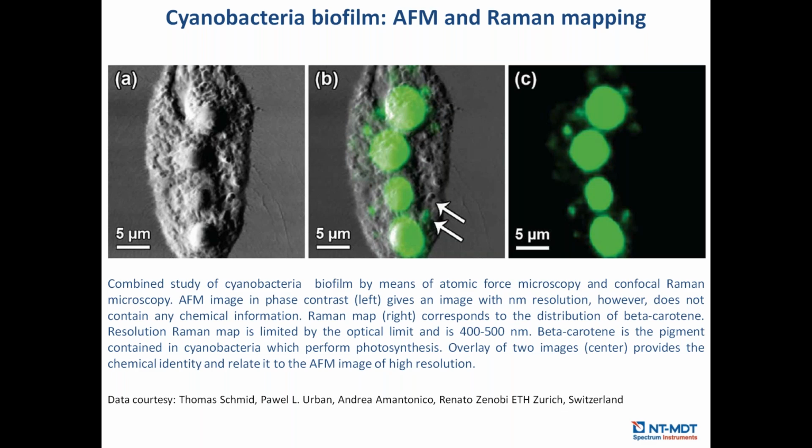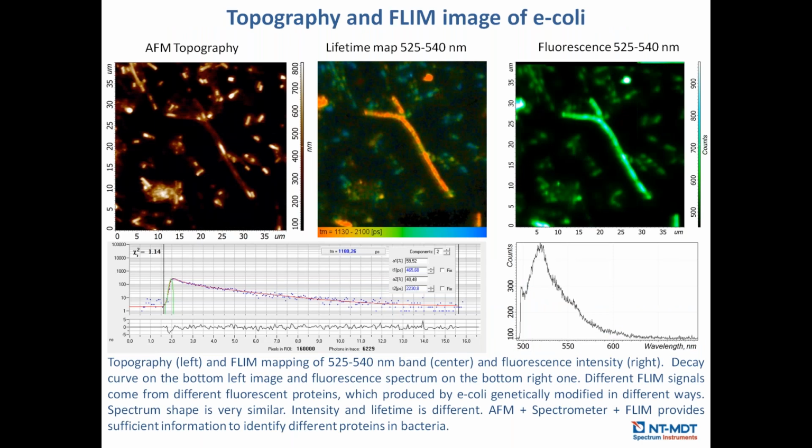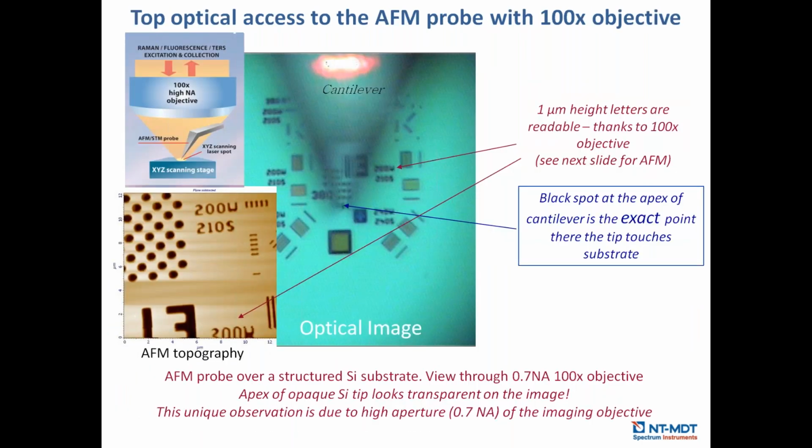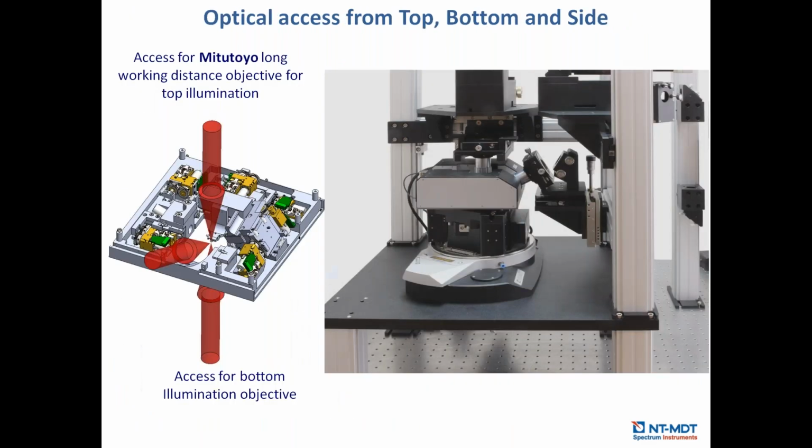Okay, another question: does the topography affect the Raman intensity signal? Yes, of course, topography affects the Raman intensity. We should focus on the surface, and if there is a strong variation of topography, then we can be out of focus if it is just a pure Raman mapping.